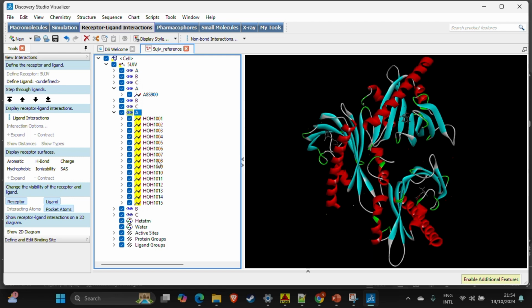And depending on what molecular docking software you will be using, you will want to remove the water from our structure before we submit them for analysis, because if the molecular docking software does not remove these water molecules, they may possibly interfere with the ligand accessibility, so the docking might not be accurate, right?